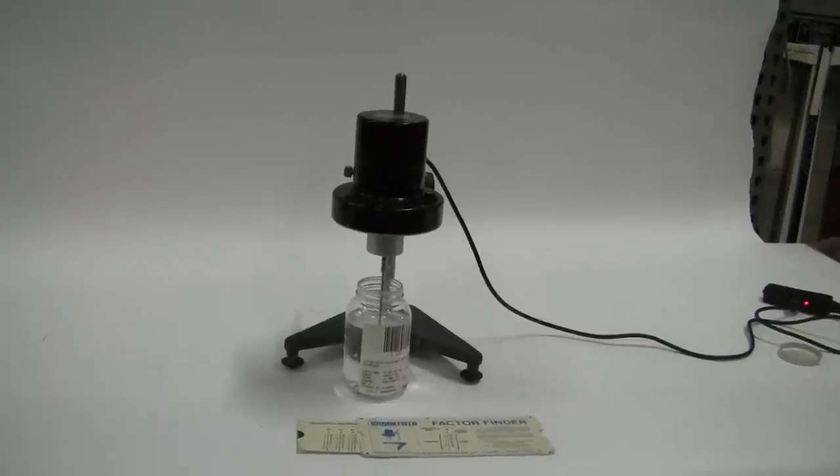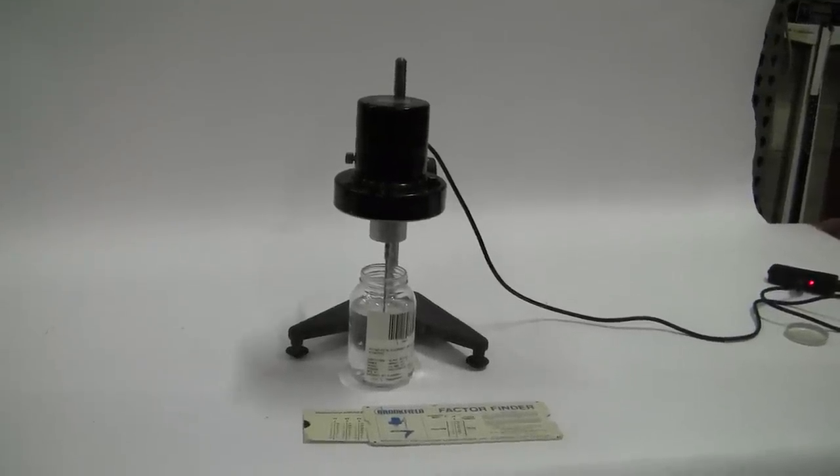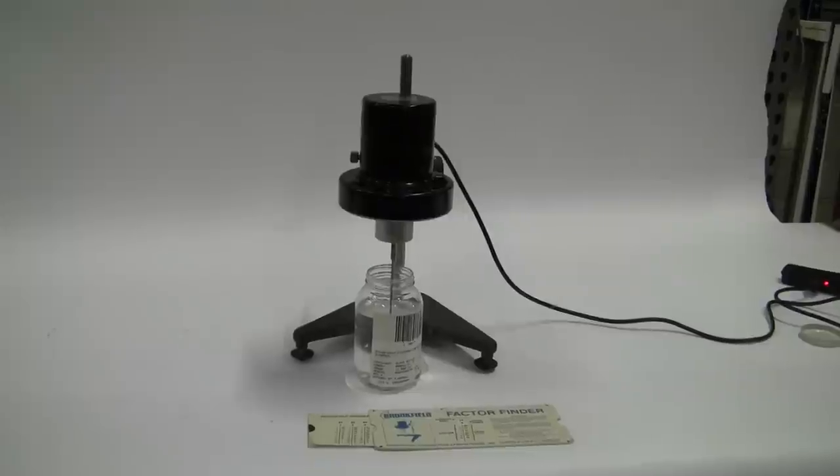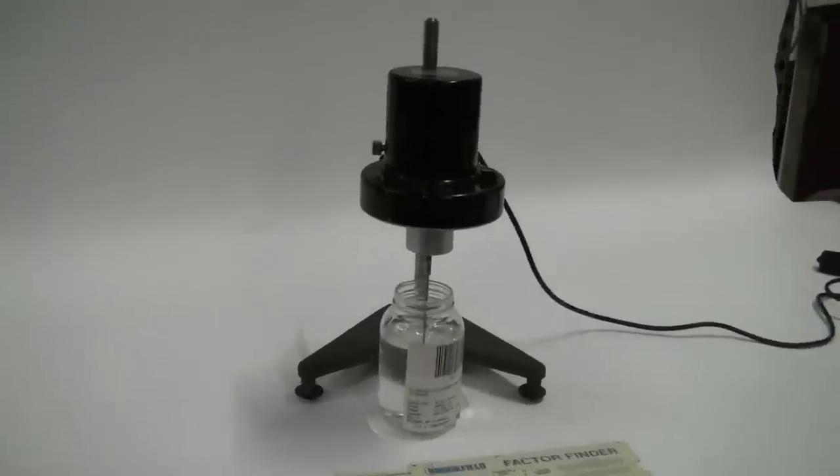Hi, this is Hitech Trader. Today we're looking at a Brookfield LVT dial reading viscometer. It's presently running.